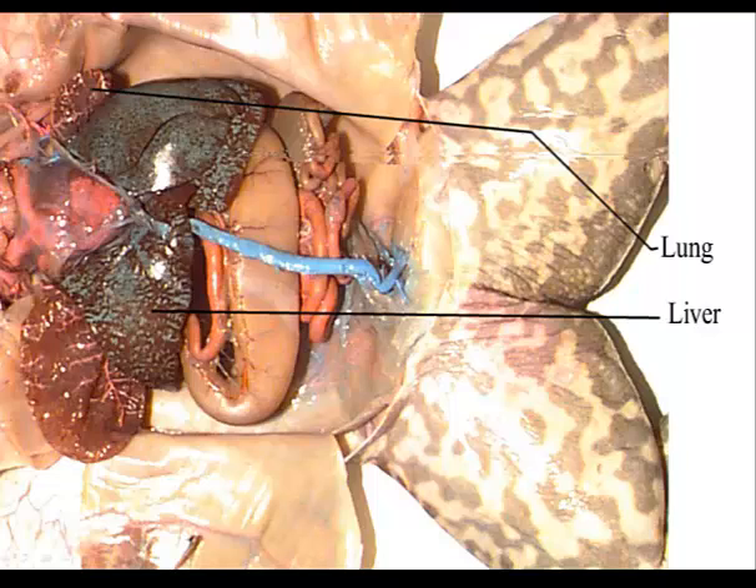Insert a probe into the glottis up in this area to see movement. If the glottis is large enough and you can open it up, you might be able to see a fold on either side, which would be the vocal cords that the frog uses for croaking.